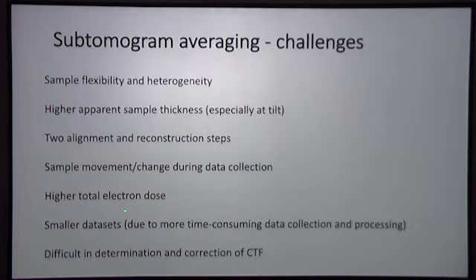We're typically using higher total electron doses. We typically have much smaller data sets because the data collection is much more time consuming, and it can be more difficult to determine and correct the CTF because we've got much lower signal to noise individual images, and we've got a three-dimensional volume challenge.